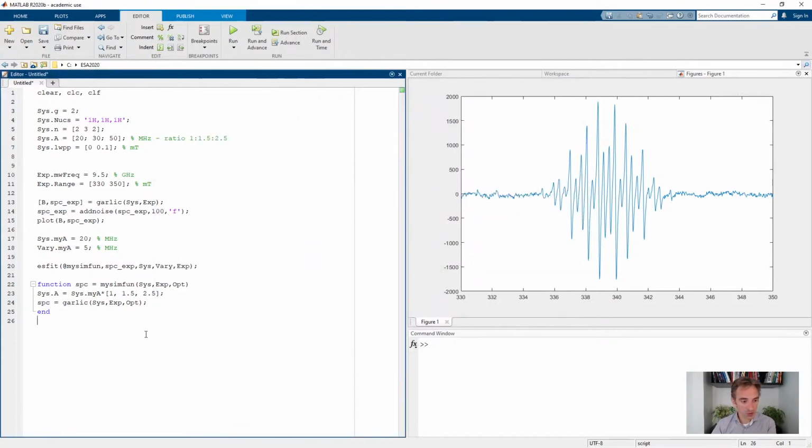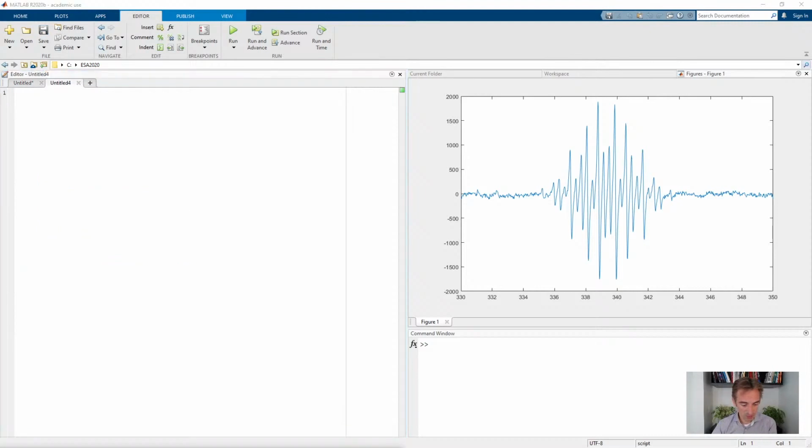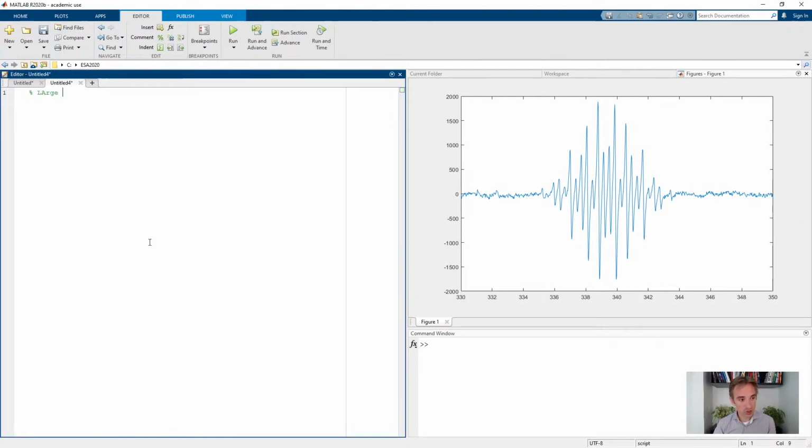All right, that was the first example. Let's do a second example of coupling spin system parameters together. When you have high spin systems, and your zero field splitting is very large, then very often your spectrum does not depend on the actual zero field splitting, but only on the ratio of two parameters, E over D. And so let's make an example for that. For example, large zero field splitting: the spectrum depends on E over D, not on D and E. So zero field splittings are parameterized by these two parameters, D and E.